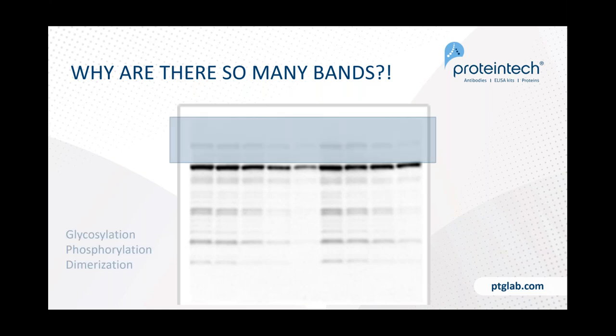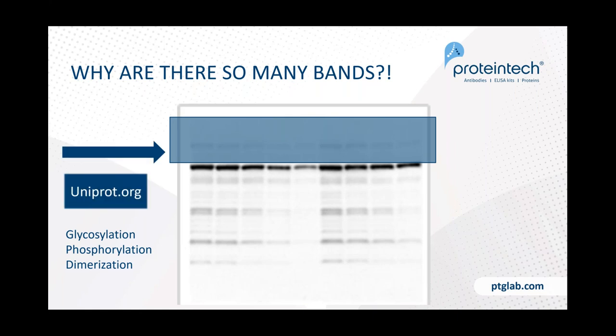Now let's talk about bands appearing above the expected molecular weight. You're all familiar with phosphorylation and dimerization, but also consider glycosylation. UniProt.org is again a great resource for finding this type of information to make sense of your results.